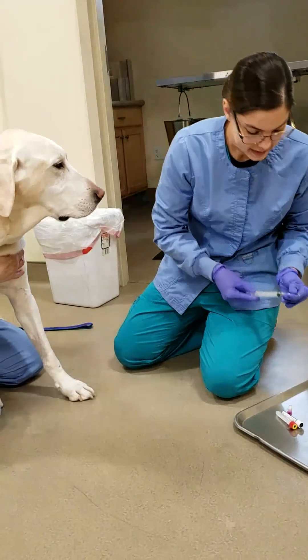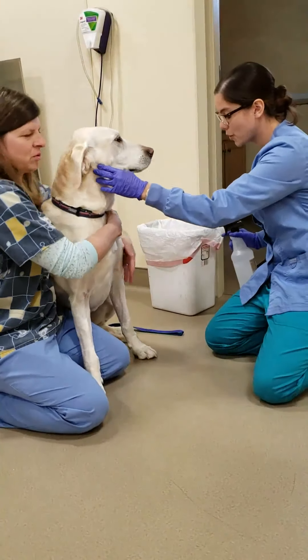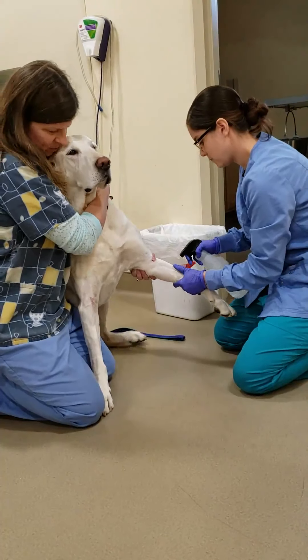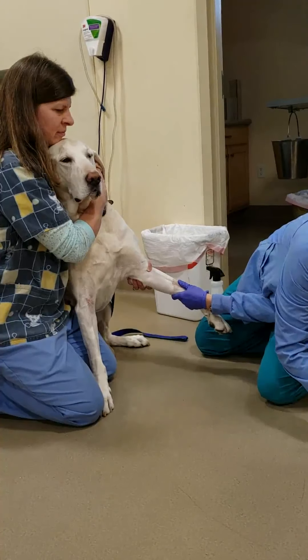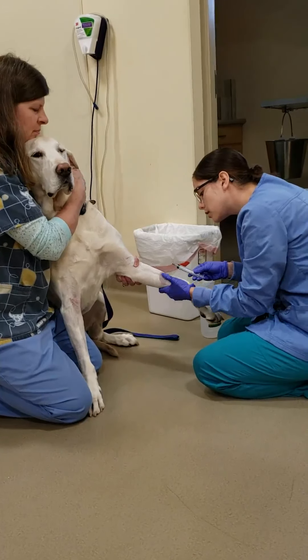Our lovely assistant Jake is going to help us today. We want to insert our needle bevel up.